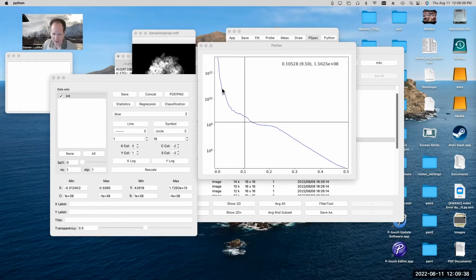Certainly you can do those things, but it's not really necessary to make simulated data that good for most purposes. But if we don't at least take the first step and put some CTF and some noise in, then we're just not going to be doing a very good test of our data. So that's what we need to consider next.